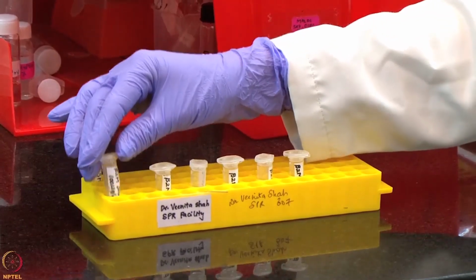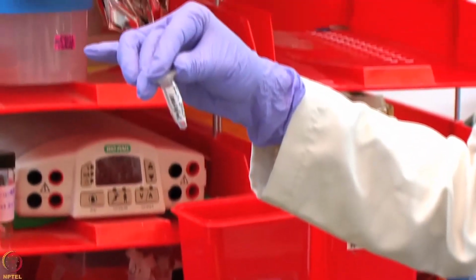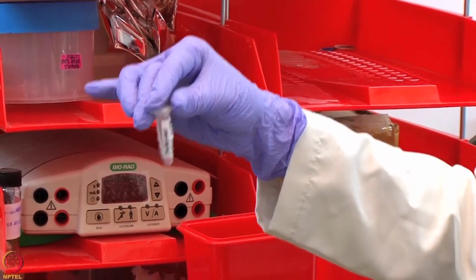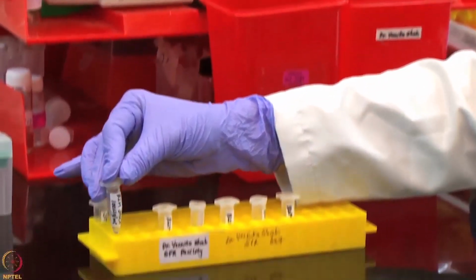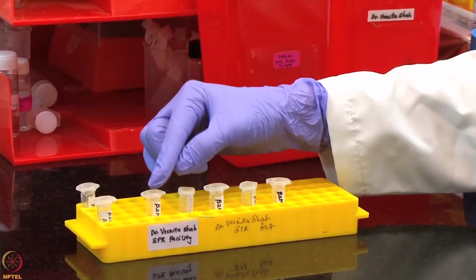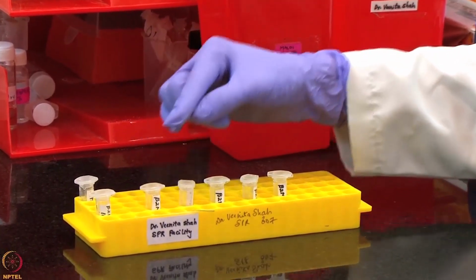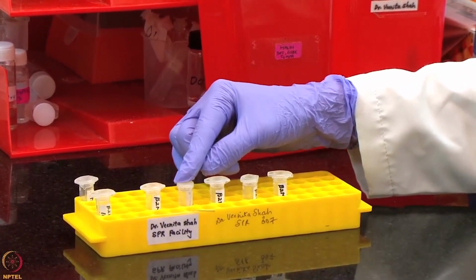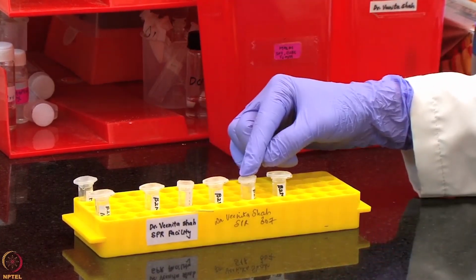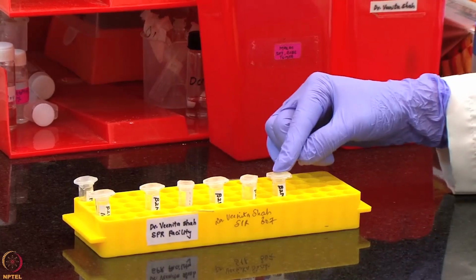We will be using our protein stock concentration of 100 microgram per ml to prepare 5 different concentrations of protein, including 32 nanomolar, 16 nanomolar, 8 nanomolar, 4 nanomolar and 2 nanomolar.